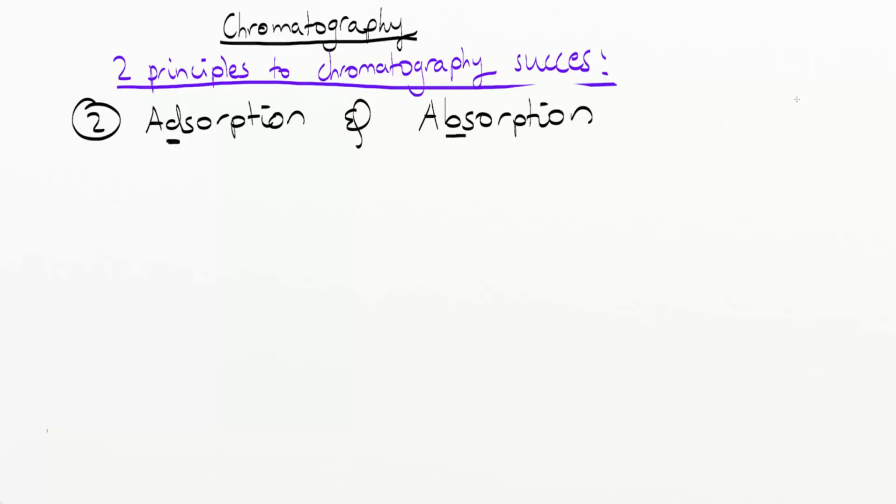The second rule that we need to know for chromatography success is the principle of adsorption and absorption. Sometimes these are stylized or spoken as adsorption and absorption. What's the difference?